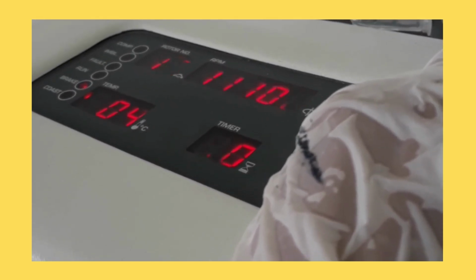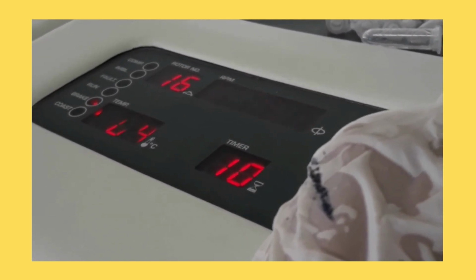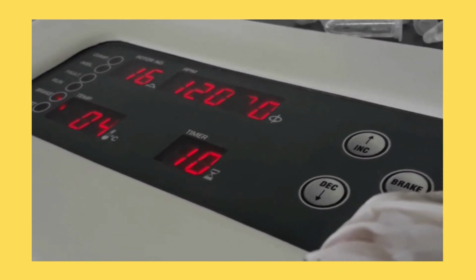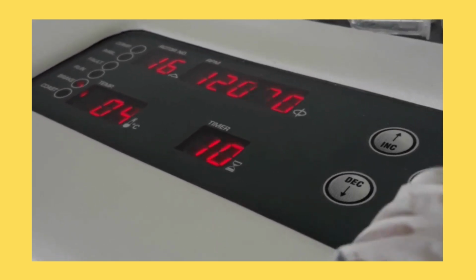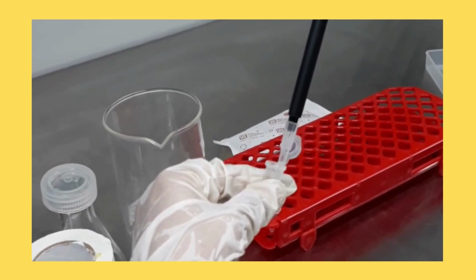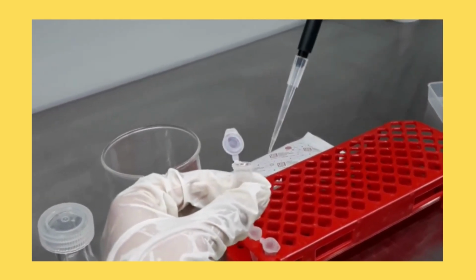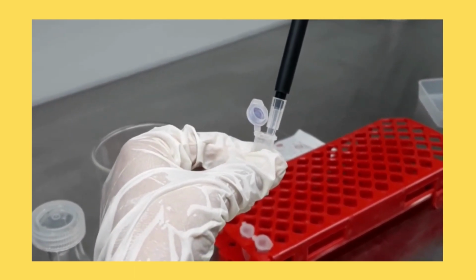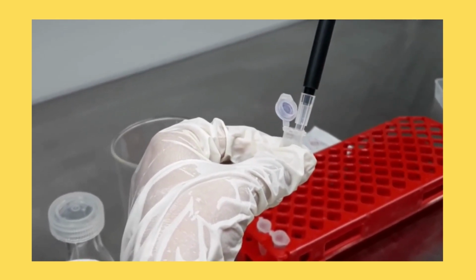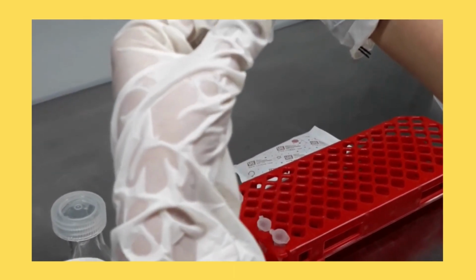After 2 hours of incubation, centrifuge the tube at 12,000 rpm for 10 minutes at 4 degrees Celsius. Now, to give an RNA wash, remove the supernatant and wash the RNA pellet by adding 300 microliters of 75% ethanol. Mix gently by inverting the sample for a few minutes.